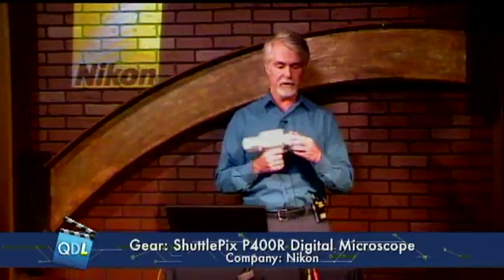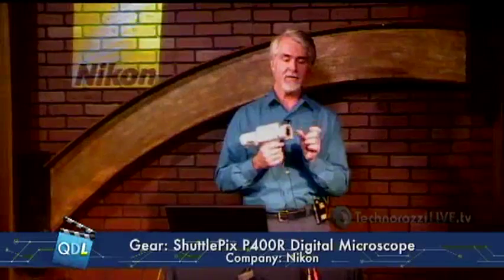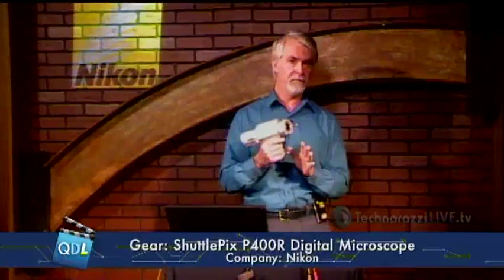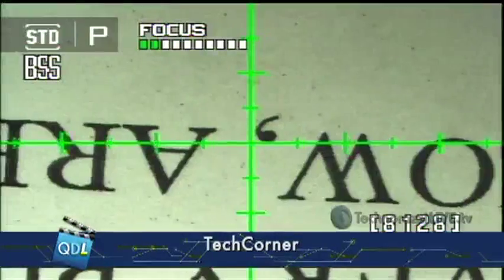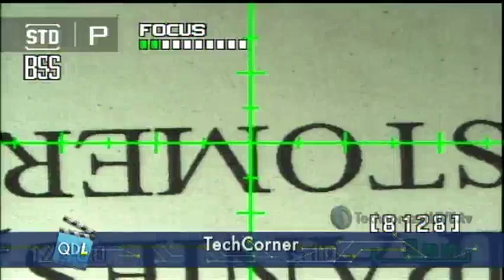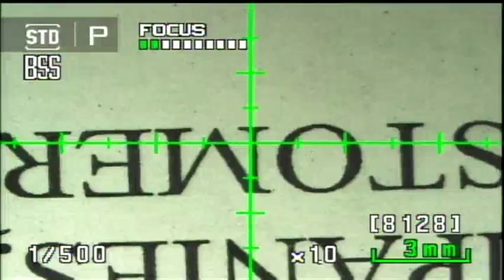To use it as a portable device, I need to put a small standoff spacer on the front. Microscopes have very shallow depth of field and a very short focal distance, so handheld use at any zoom factor is nearly impossible without a spacer to maintain the correct distance from the subject. At 1x zoom right now, you can see I've placed it down and it's immediately in focus because of the standoff.